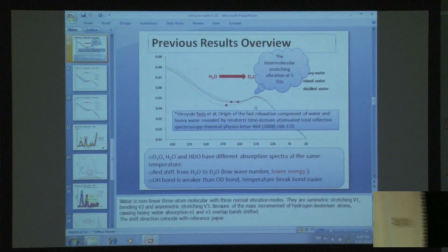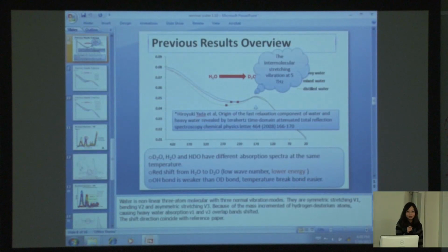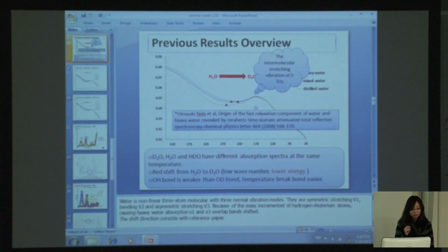Because water has 3 types of vibration: symmetric and asymmetric stretching and bending. I read some reference. It said the symmetric and asymmetric stretching bands will overlap.